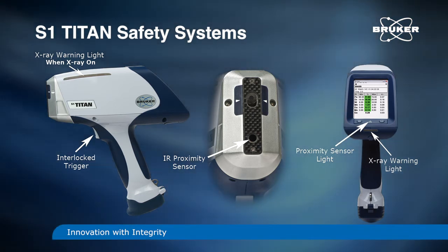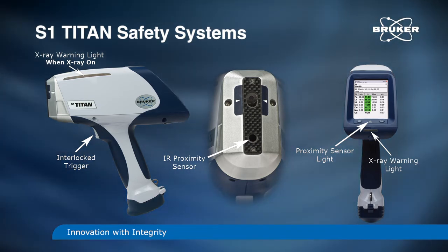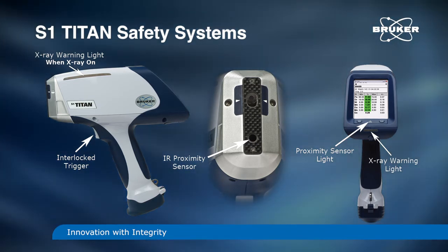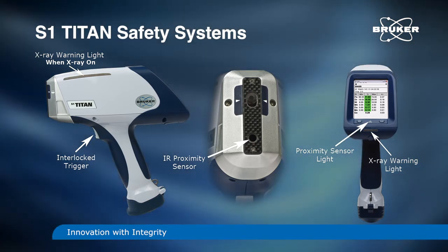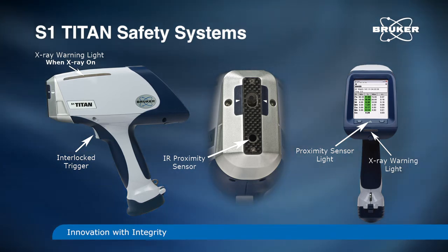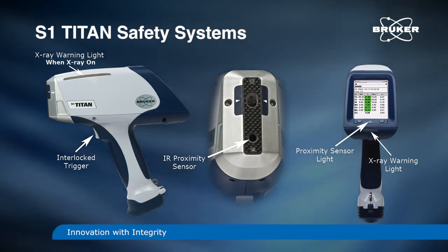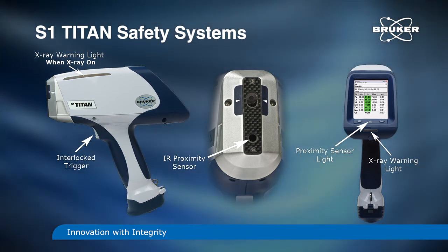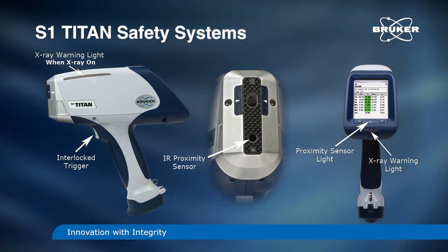When the trigger is activated, an audible alarm alerts the operator and those nearby that the unit is generating X-rays. If the analyzer remains idle for a set period, the program will require the operator to log back in, restoring the previous session. These controls are designed into the XRF analyzers for your protection. Do not defeat or tamper with the interlocks or the fail-safe systems.